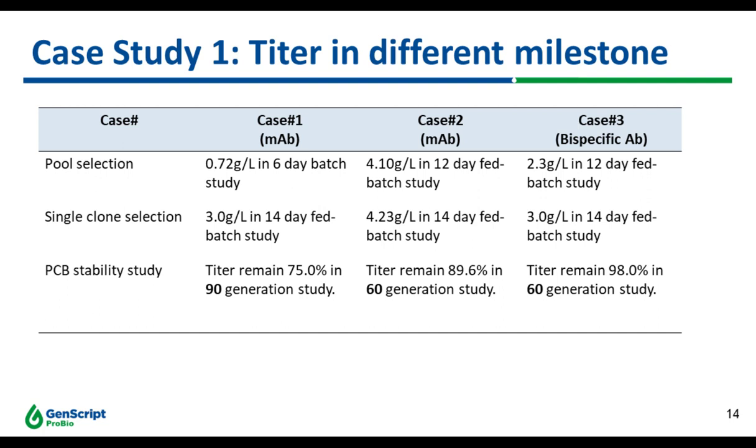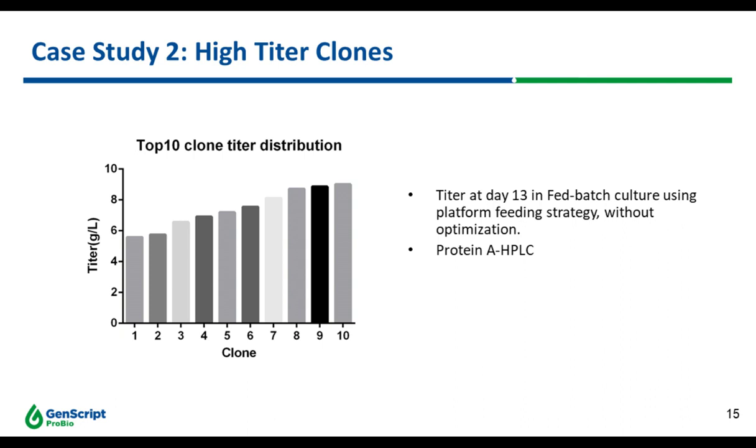Then after that you conduct a PCB stability study to make sure they can produce stable titer in the 60 to 90 generation studies, because that will be needed for the future process development.